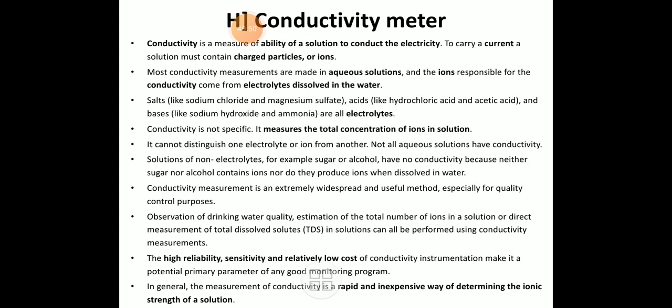Now, after this one, the conductivity meter. My friends, this is also a very interesting instrument. It measures the ability of solutions to conduct electricity. In the sense that we measure EC, electrical conductivity. We can measure the salinity status. Suppose we have a solution in our hand, we will be able to see the salinity of that one in EC, that is measured with the help of electrical conductivity in decisiemens per meter.